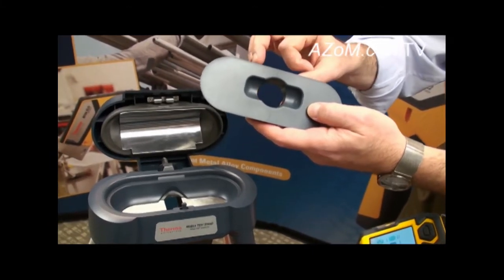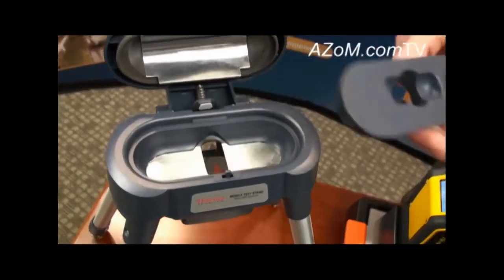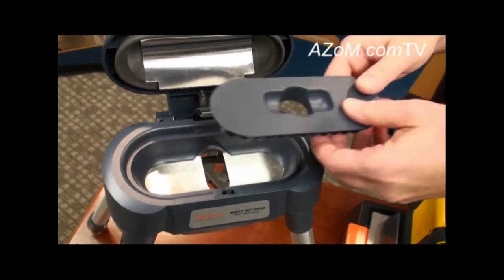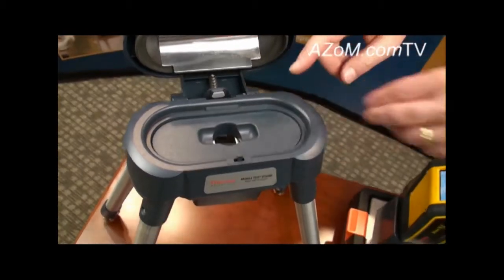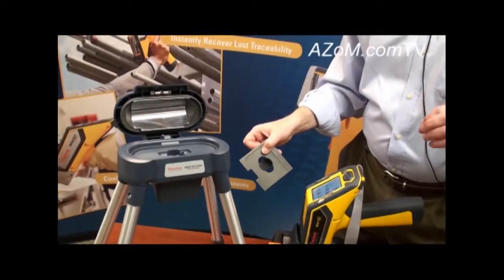If users want to analyze samples they've prepared or certified reference materials to benchmark the performance of the analyzer, they have the ability in both the mobile test stand and the Field Mate to measure cupped samples with ease.